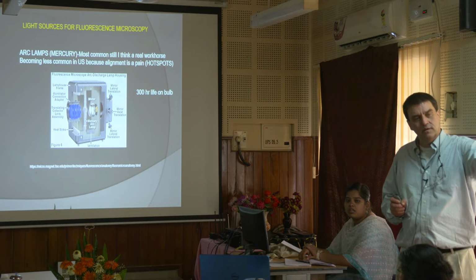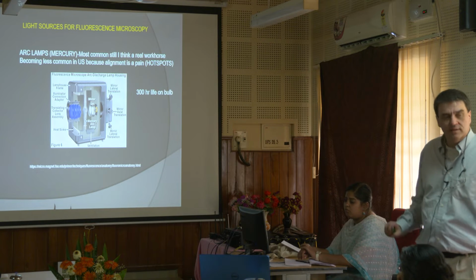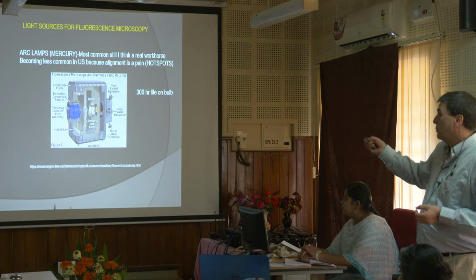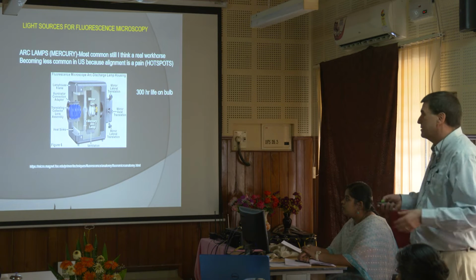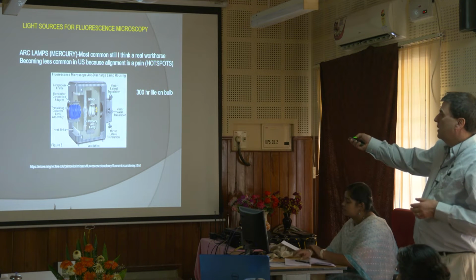So first on, last off is a good rule to follow with fluorescence, because if you encounter one of these lights and it's by a computer, it will destroy it. I've seen it happen. I had numerous customers happen to. So mine, I put on the floor, like 5 feet away from the computer, so it can't do it. But some people have to learn the hard way, unfortunately. Okay, again, very hard to line up.